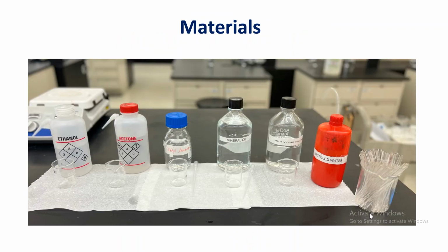So again, the materials are over here. We have ethanol, acetone, ethyl acetate, mineral oil, methylene chloride, and distilled water. We will be testing these 5 liquids to see their density and miscibility with water.